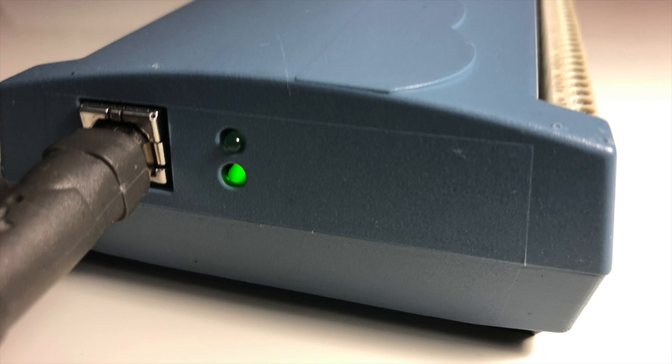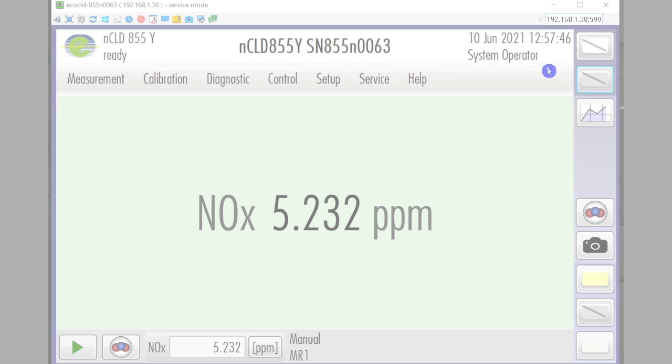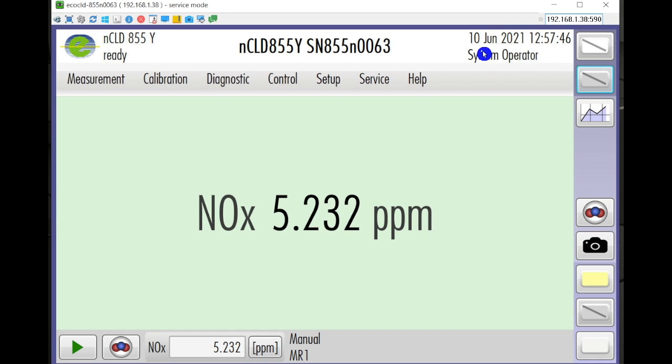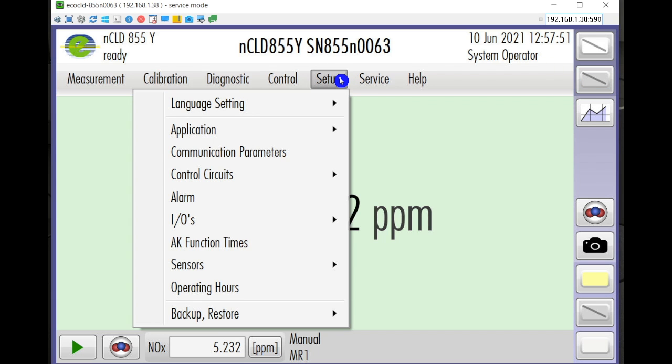Before doing anything, make sure to stop any measurements and log in as a system operator. Click on the setup menu, choose IOs and then analog output.